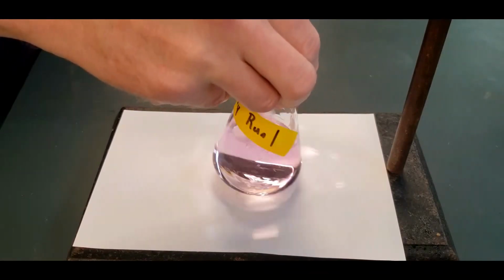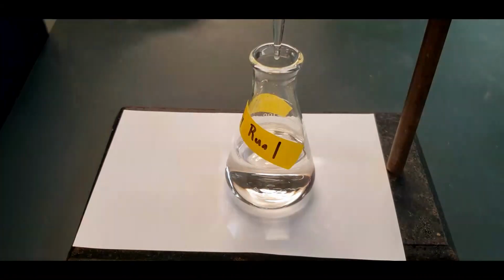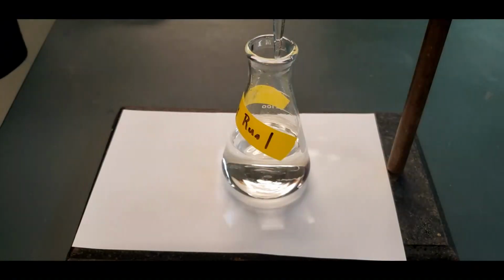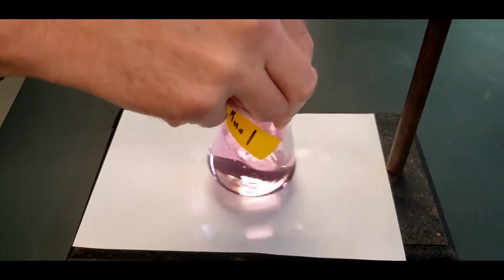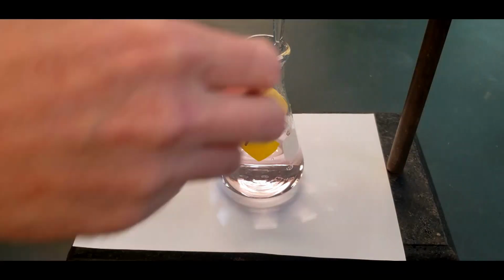What we'd like is the lightest color pink that's possible. And from my perspective, I don't know if you can see it. Yeah, there's just a slight hint there. We're right at the end of it here. So we're almost to the end point. So I'm just going to put in a drop, see how that looks. So that was 1 drop, and the color is there, and it's fading.